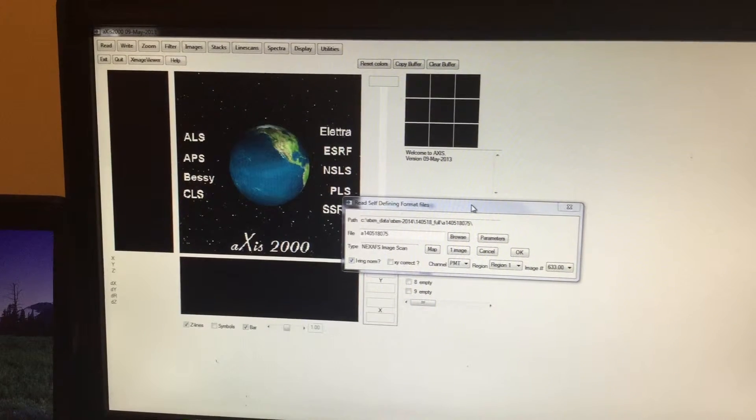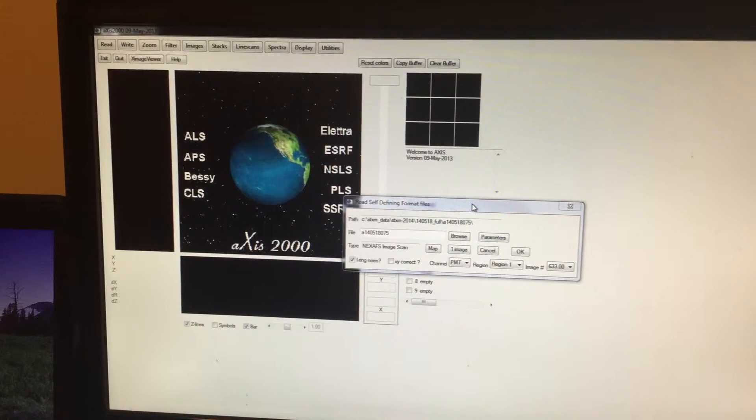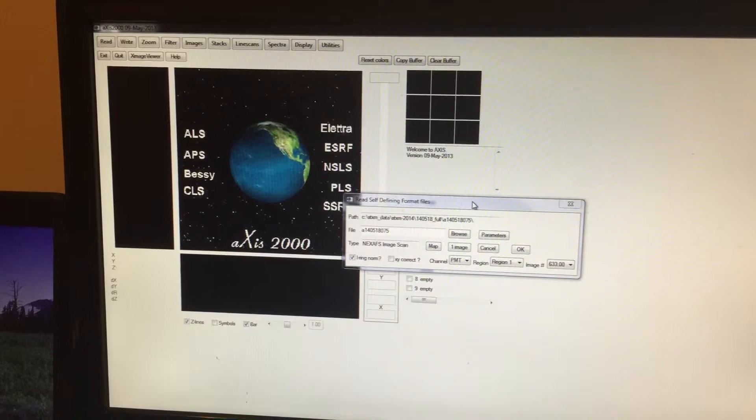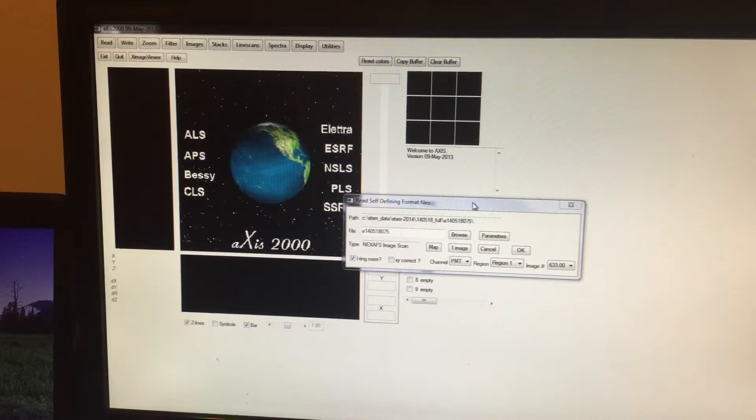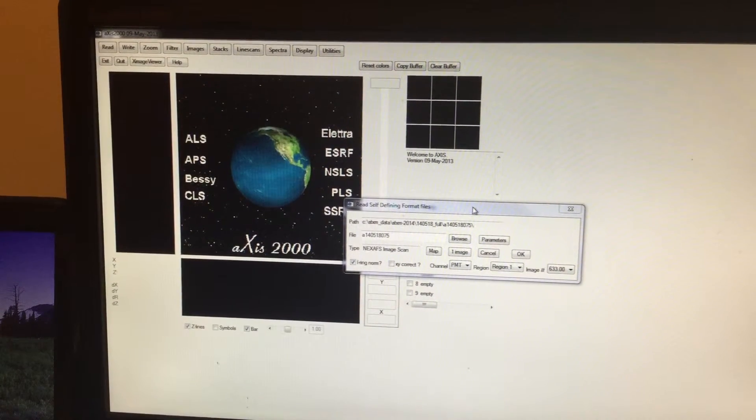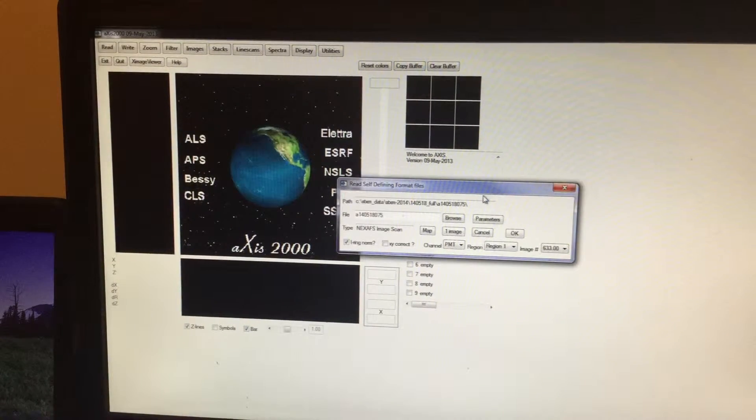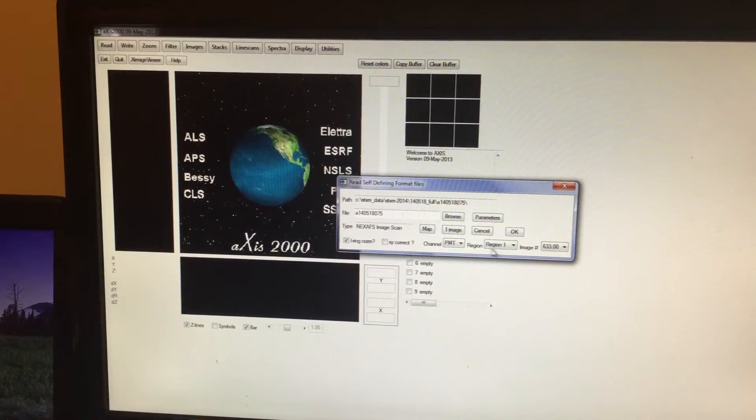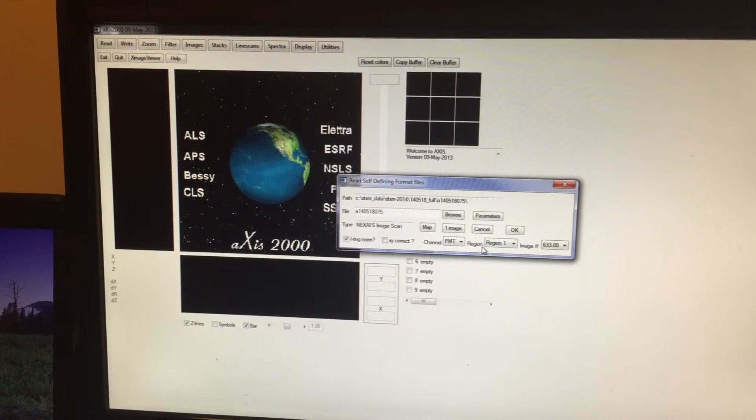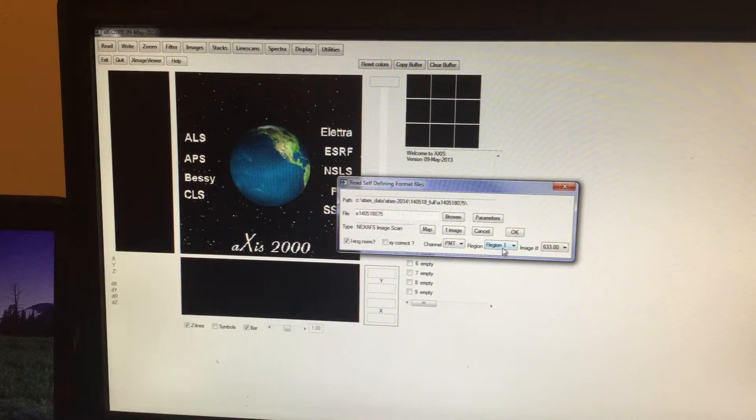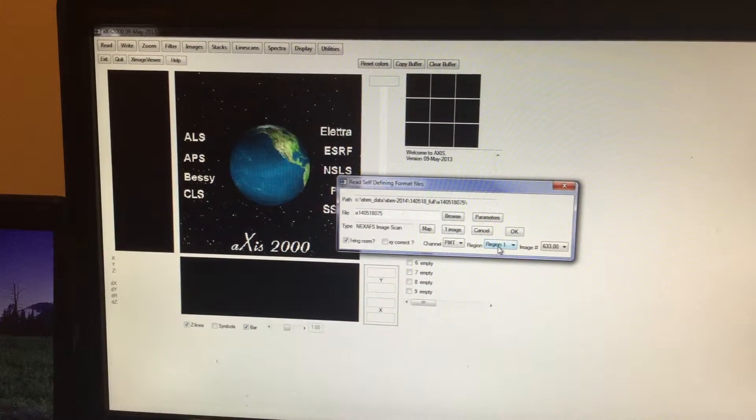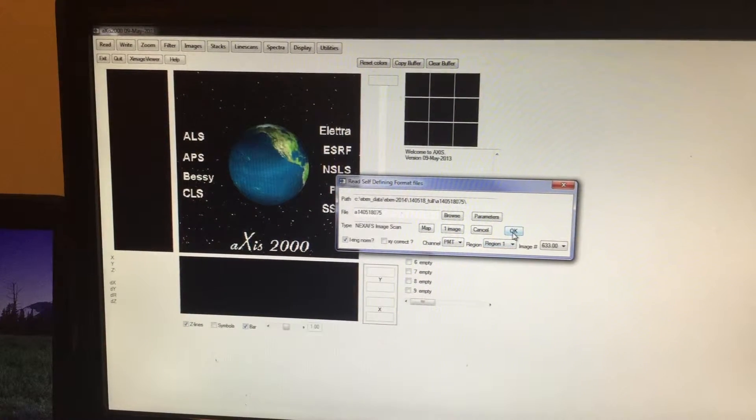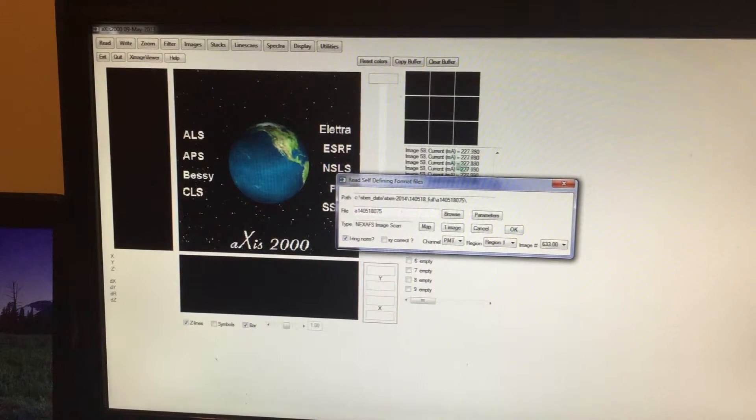As I said, this data corresponds to XMCD measurement, so it has data corresponding to both left and right circularly polarized light. Therefore it has basically two files, so I'm going to load two files. Now this is Region 1, which corresponds to LCP, so I'm going to click OK.